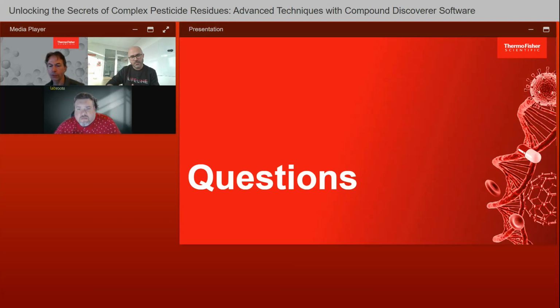So there is a node that does that. You can define one or more fragments to look for, and then Compound Discoverer will go through all the compounds. It will look at the fragmentation data, and if one or more of those fragments are found, then it will calculate a score, and the score will be higher the more fragments are found and the higher the intensity of those fragments.